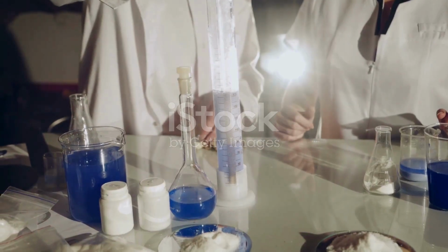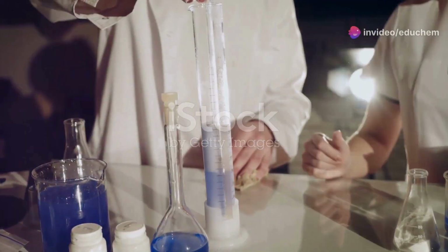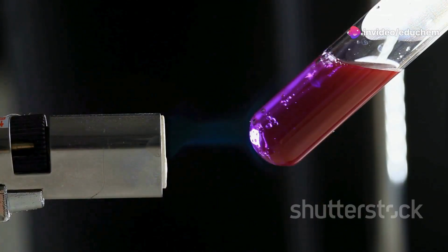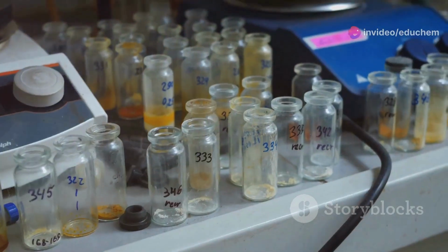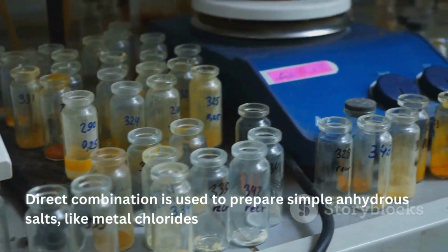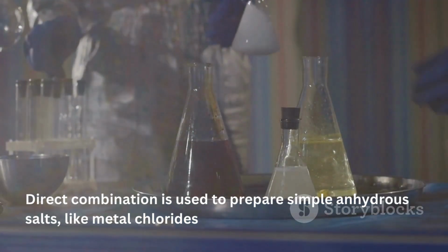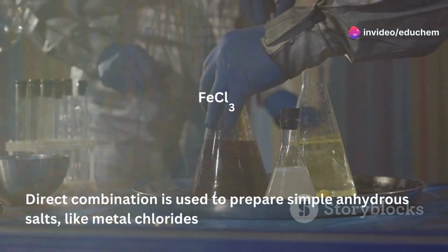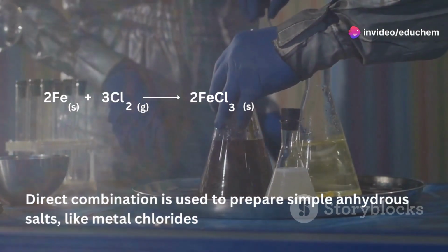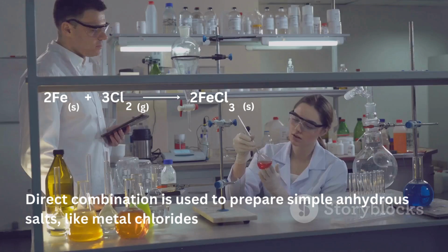Direct combination is a simple method used to prepare salts by directly combining two elements. This method is typically used for preparing salts of reactive metals with non-metals. It is used particularly when preparing simple anhydrous salts like metal chlorides. For example, to form iron(III) chloride, FeCl3, we can heat a sample of iron, Fe, over a stream of chlorine gas, Cl2, and the elements combine to form the salt.